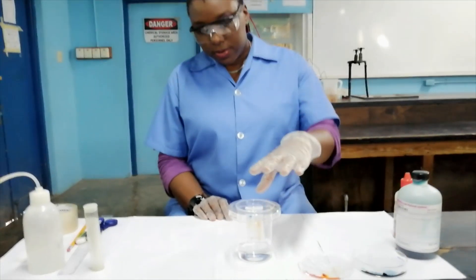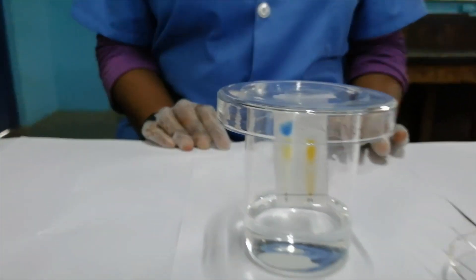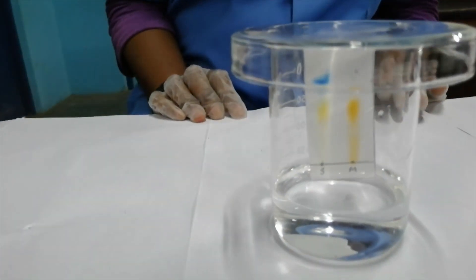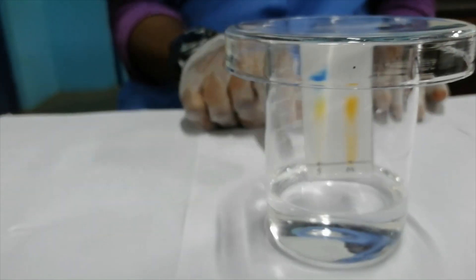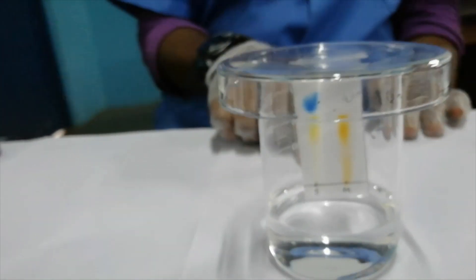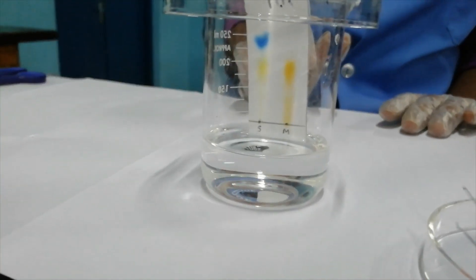This chromatogram has developed for quite a while now. You can see that we have the blue and the yellow separating for the green methyl orange and we have one long streak for the methyl orange.